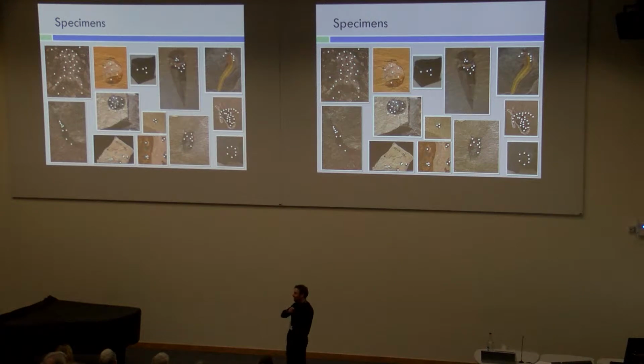So, Cambrian Lagerstätten specimens from around the world. And I did point spectra, so that's important. Point spectra, because you can't really do mapping directly on specimens because of the topographic relief. So now for some results.